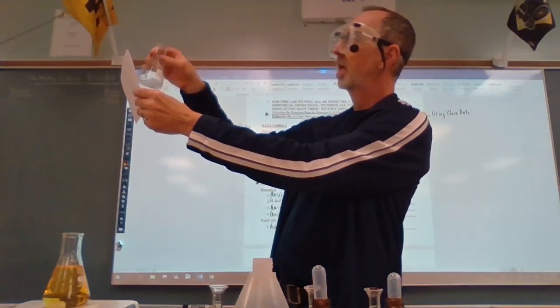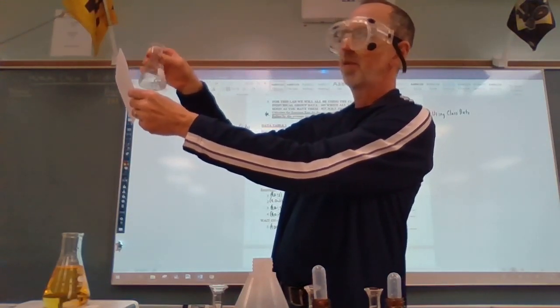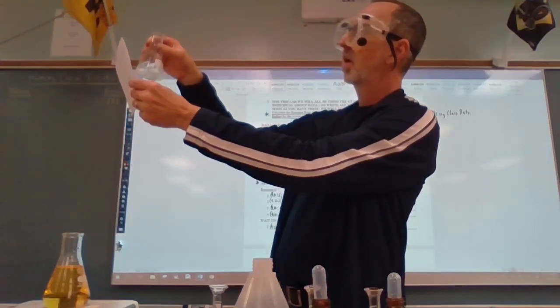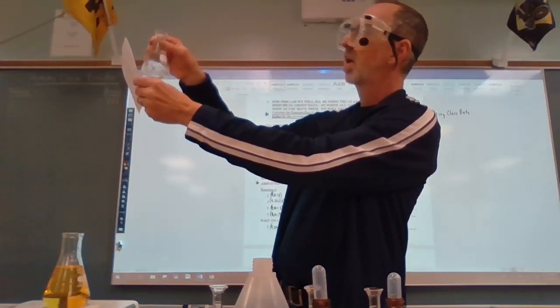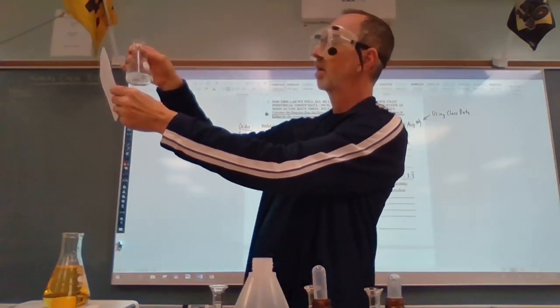Once again, we are getting close, very close. The white paper really helps. We are about there. In fact, we are there.